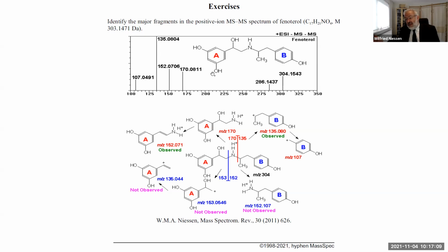Then I get a number of hits for the precursor ion, and then I start trying to do similar calculations for the product ions, which in most cases will reduce the number of possible hits for the precursor ion. And I will actually show you an example of that, I think, when we come to the last session of the course.